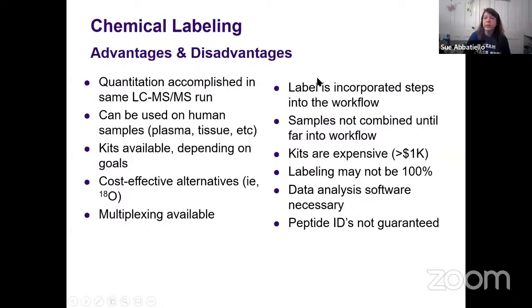No. Usually the interaction of... not disulfide. So if a cysteine is cross-linked with another cysteine, you usually can reduce those, making free thiols, which then should be reactive with other things. But if a cysteine already has been modified or, like, methylated, I'm not an expert in the full nuanced chemistry. If that reaction is reversible and you can reduce it, then yes, it should be fine. But if it's not reversible, then obviously that site is now blocked and you can't label it.